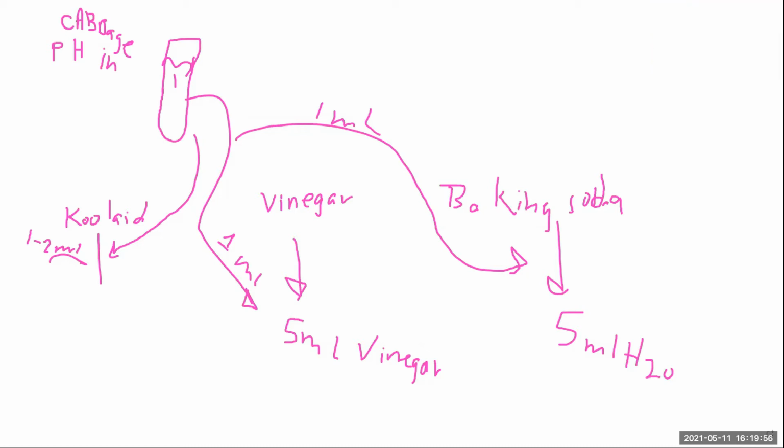Is this all going to an Excel sheet? You could do it in an Excel sheet, or you could just do it in a simple lab report, because I guess there's a couple of calculations. There's no need for a graph, unless you guys want to just show me your error that's associated with it.